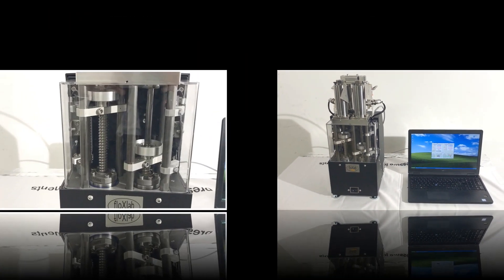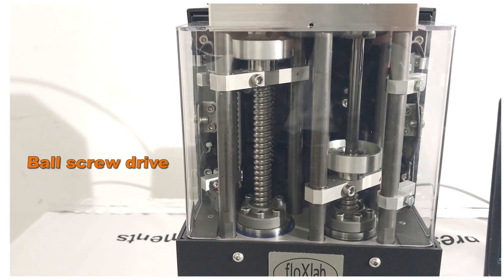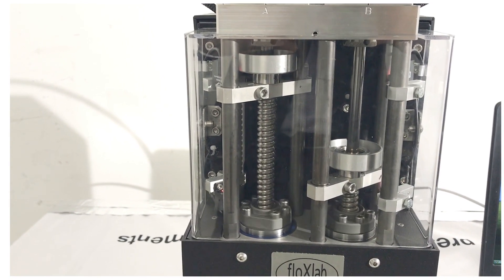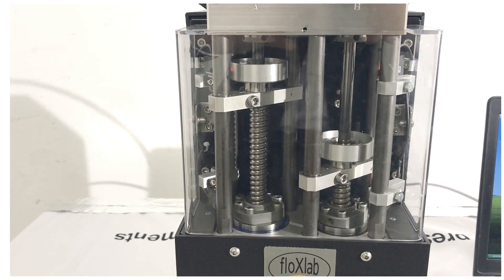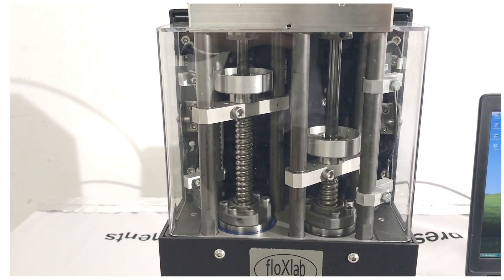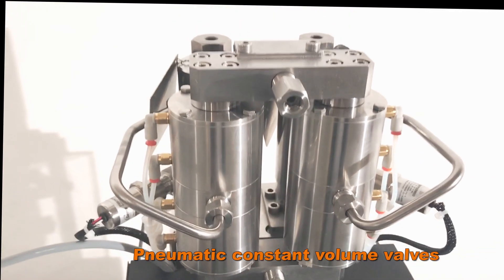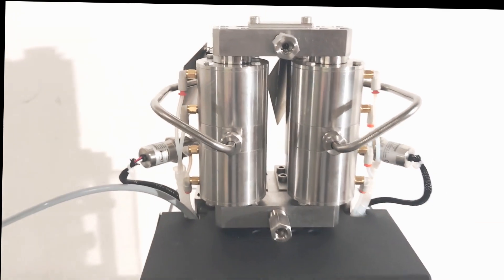The pump uses two motorized ball screws to move the pistons back and forth in the cylinders. While one cylinder is delivering fluid, the other cylinder quickly refills and then pre-pressurizes to match the pressure of the first cylinder. The use of two constant volume valves ensures smooth pulse-free fluid flow.